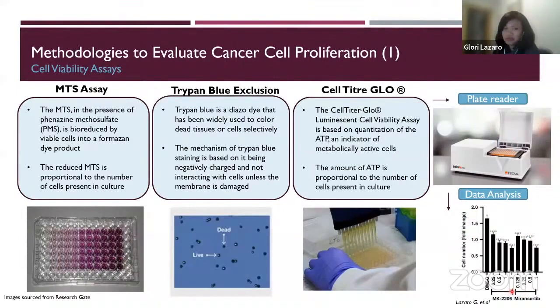So this is an experiment that I did. So these are breast cancer cells treated with 2 types of drugs. So DMSO here is the control, and you can see here increasing doses of the drug from 0.25 micromolar. You increase the dose, you can see that the cells are dying. So again, this is from using a trypan blue assay, actually. So control cells very much alive, and as you treat the cells with the drug, slowly namamatay na sila. And you can graph this out, and this is how we present things in a paper or in a conference. So yeah.